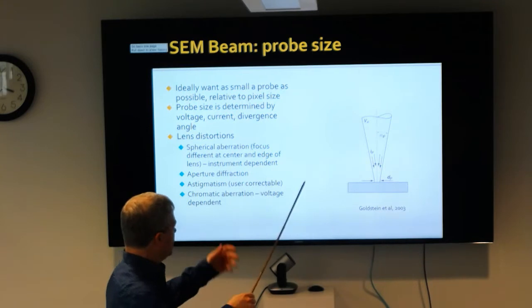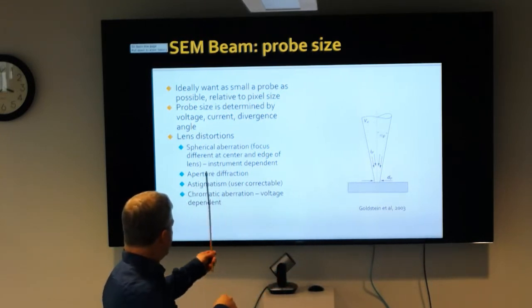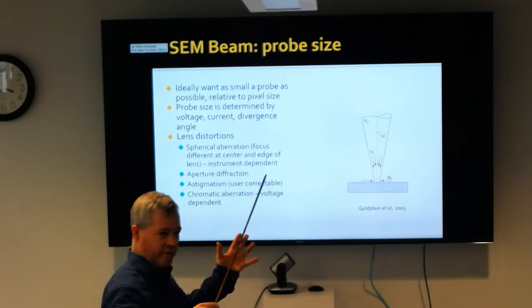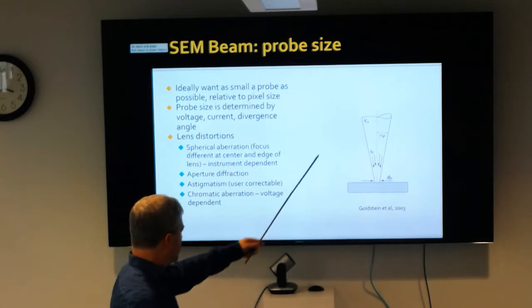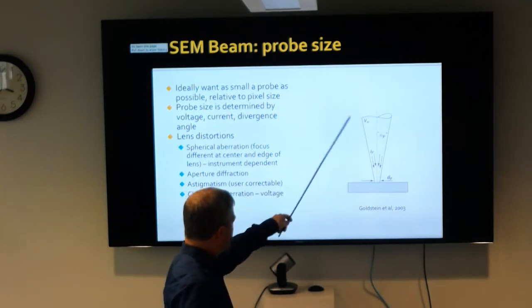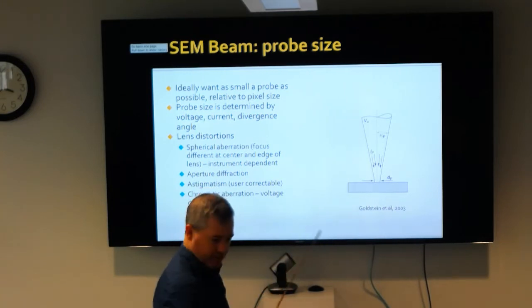So you have to align the instrument as well as possible to get this down to a point. For astigmatism, you tune it as well as you can so that it doesn't look astigmatic. When it's astigmatic, it's blurred out in one direction. It's different from the TEM, where you have Thon rings. In this case, you're looking at the image that it forms and tuning it yourself to get the clearest possible image. You align the scope yourself to get a nice image at the end.